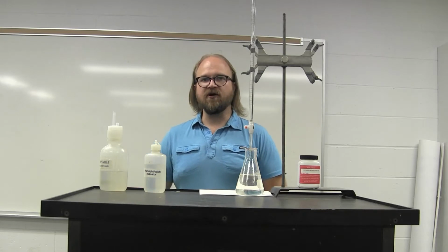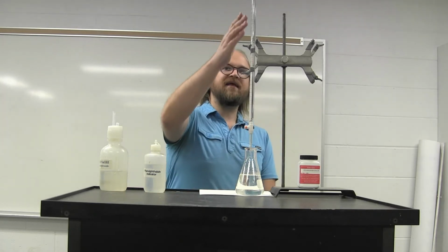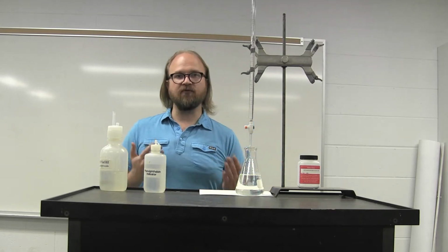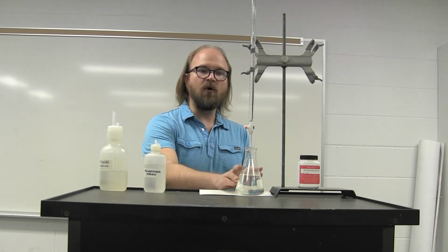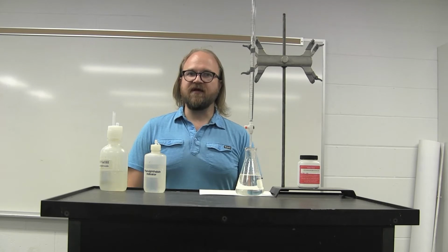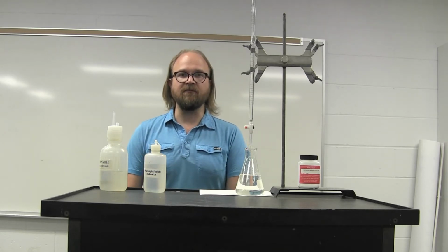Many times these can occur in analytical type settings where you want to measure a very precise concentration. By adding a very precise amount of a known solution and knowing the stoichiometric ratio of the reaction, you can determine the number of moles in an unknown solution. This can be done in acid-base chemistry, in complexation, redox chemistry. There are a number of different ways to perform a titration and reach a desired outcome.